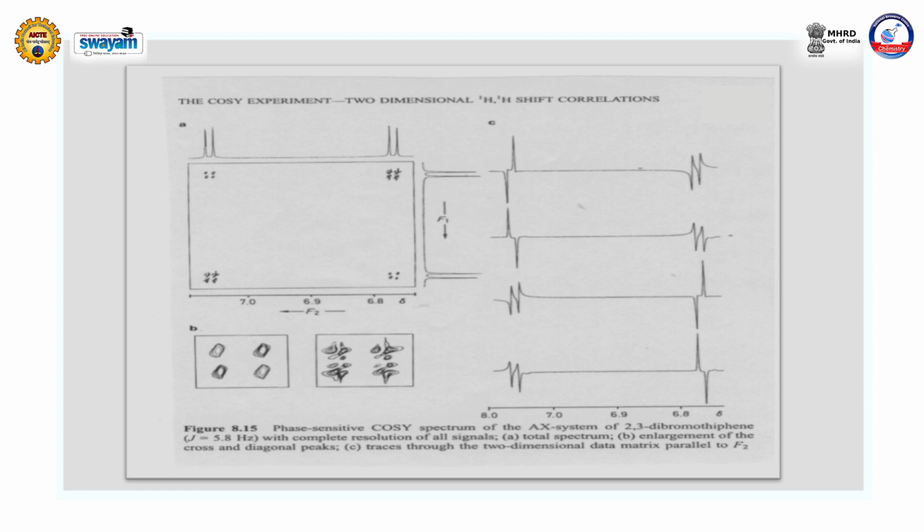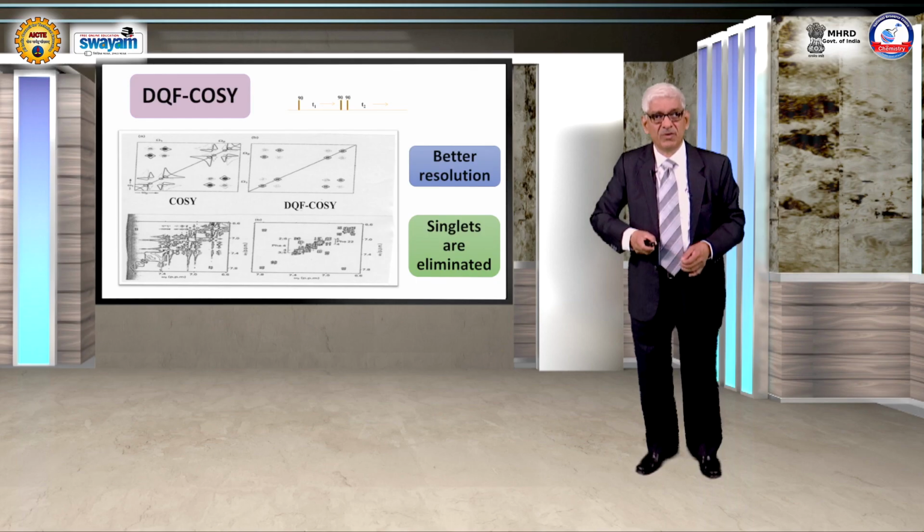You can see the cross peaks are clearly indicated, very well resolved doublets, positive and negative, negative positive, and the diagonal is quite a messy structure. This is because of the line shapes. The dispersive line shapes don't produce a very fine appearance of the cross peaks, and this results in loss of signal to noise and resolution in your spectrum. So therefore you developed a new experiment.